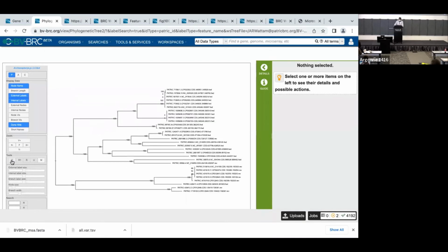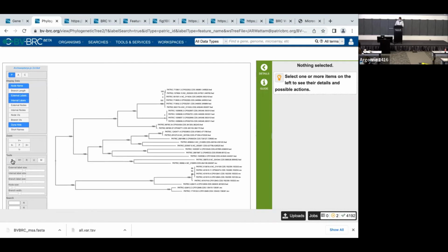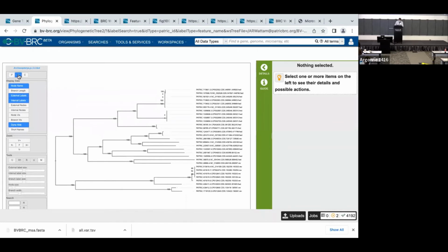This O button applies that ordering to make the densest branches cluster at the top, and I guess clustering at the other, clicking it again, flips that to the opposite. Also, there's these 3 views of the tree here, and this one simply aligns the tip labels off to the right side. That can sometimes make it easier to read the tip label, although sometimes it's more difficult if the tree is very uneven and they're very different depths.